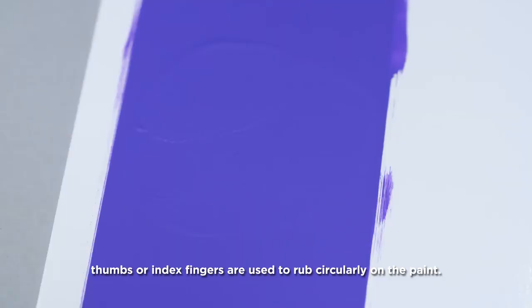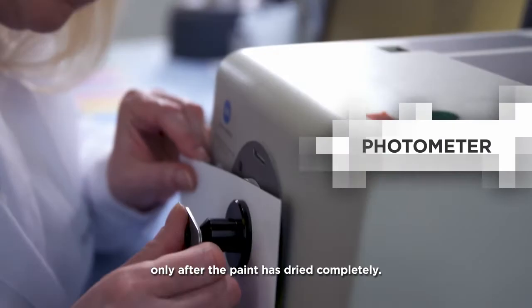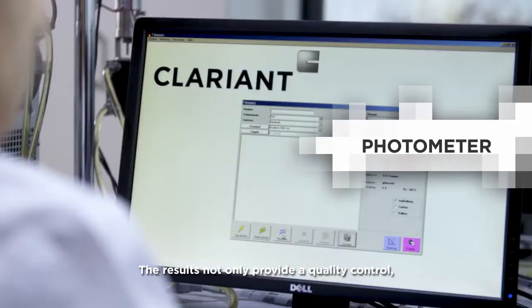Whether it was a good or bad formulation can be determined only after the paint has dried completely. The results not only provide a quality control, but reveal compatibility issues within the paint system.